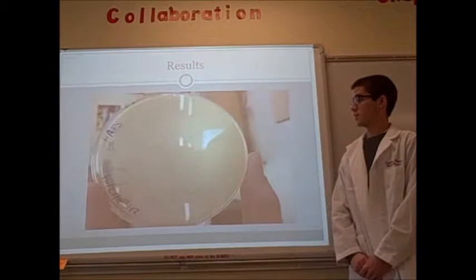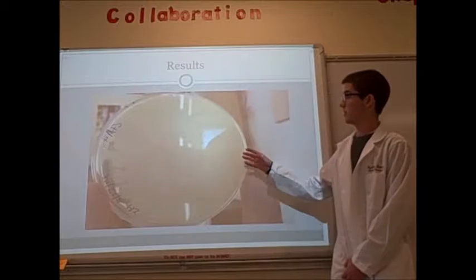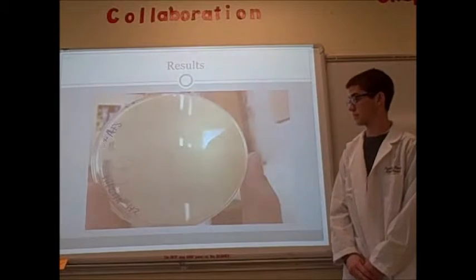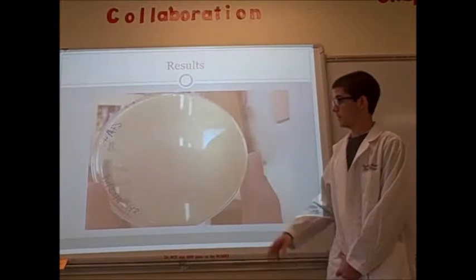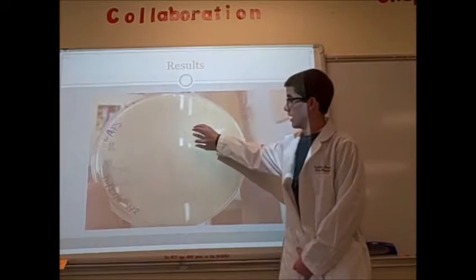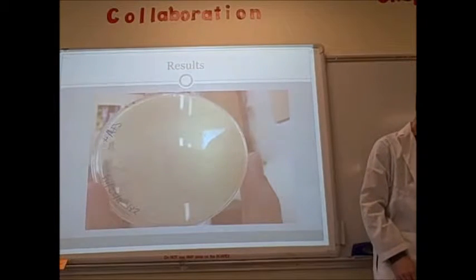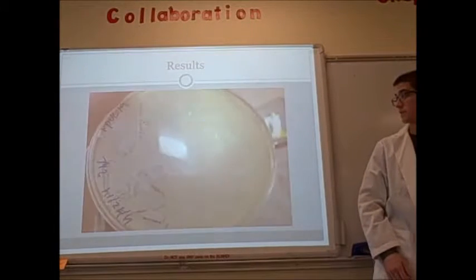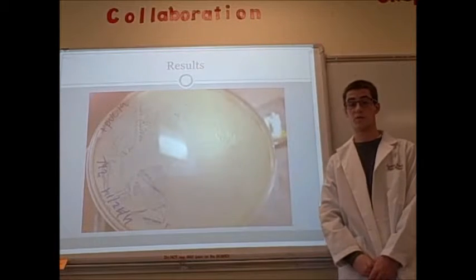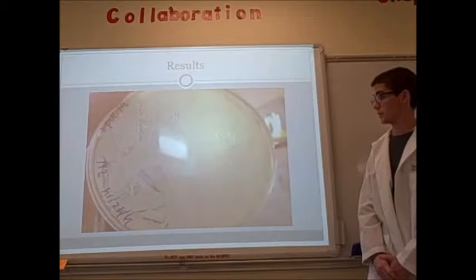Here is another positive M13 plate, but this one was not the control plate, so this is plated on both the IPTG and X-gal solution, allowing for blue-white screening. There were, however, no blue plaques, although there are plaques located throughout the plate, but they are somewhat dilute. This does mean that there were some bacteria that were transformed, because they would need to be transformed to produce plaques.